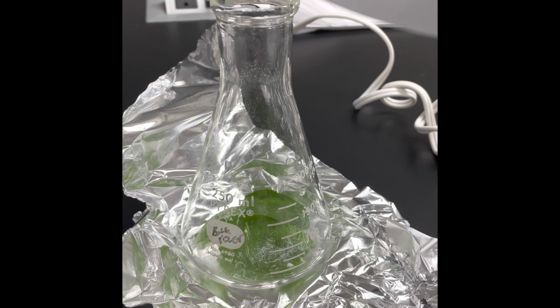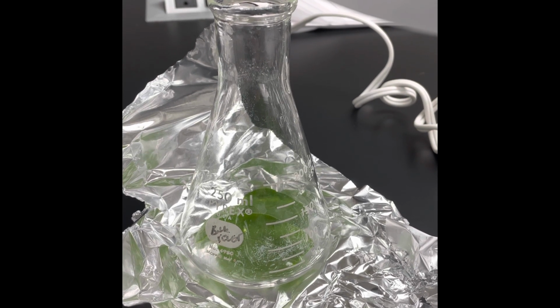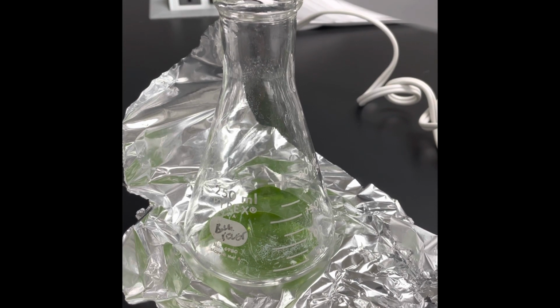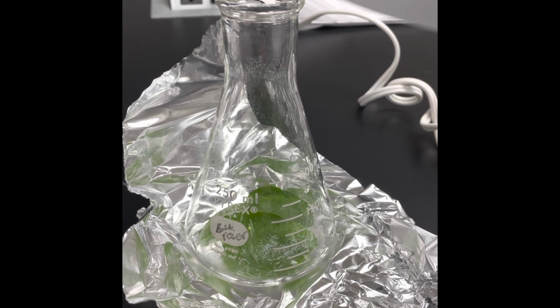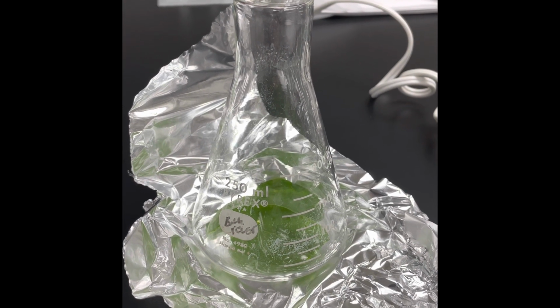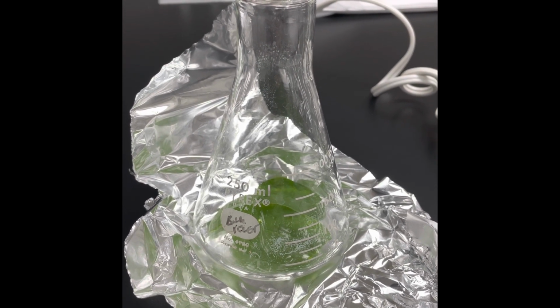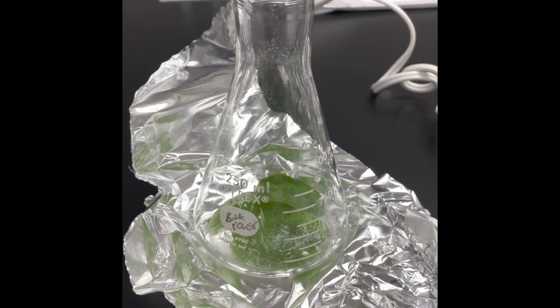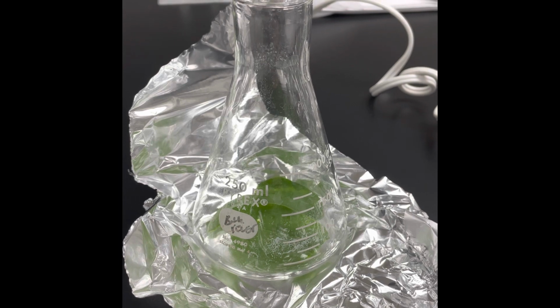Important question. I seal it, I put the carbon dioxide detector in, I turn the light on. What do you think is going to happen to carbon dioxide? Do you think it's going to go up? Do you think it's going to go down? Or do you think that it's not going to change much over the course of 8 minutes?